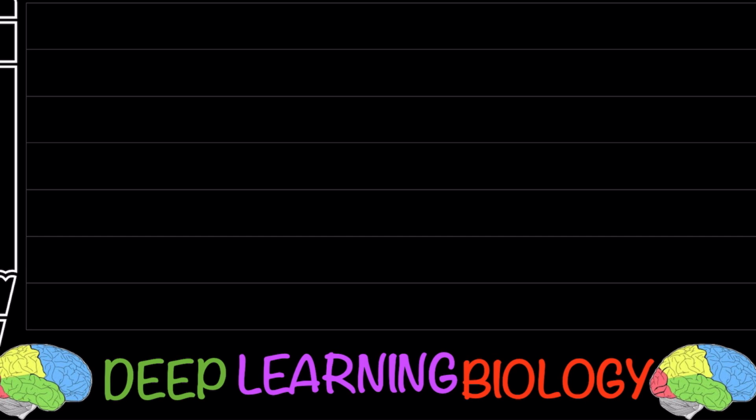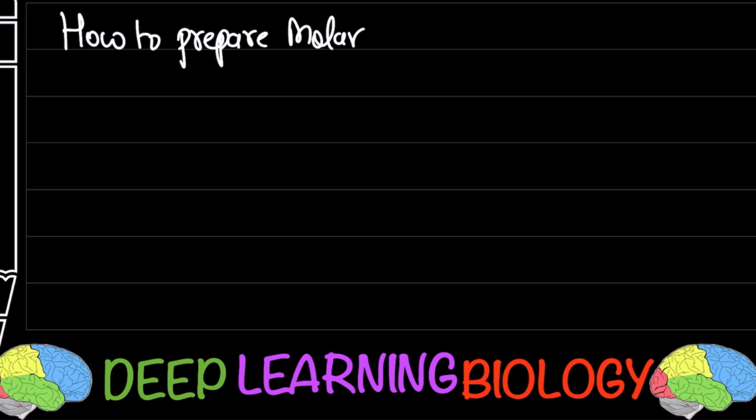Now in this video I am going to teach you how to prepare molar solutions. So in this video you are going to learn how to prepare molar solution.